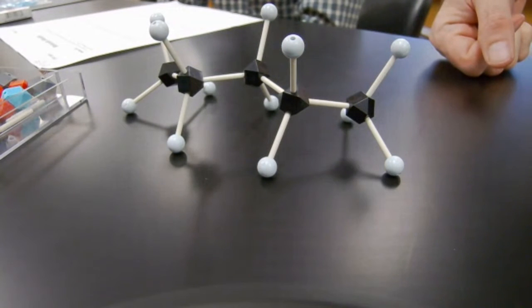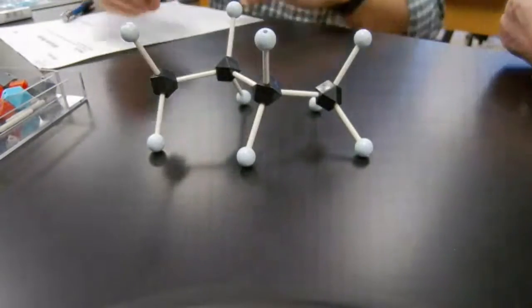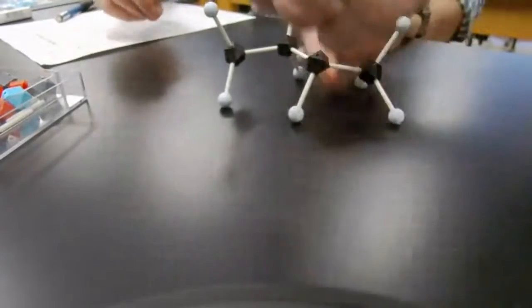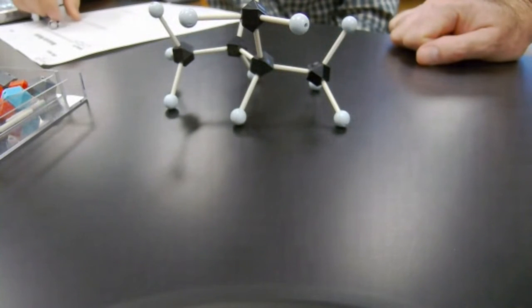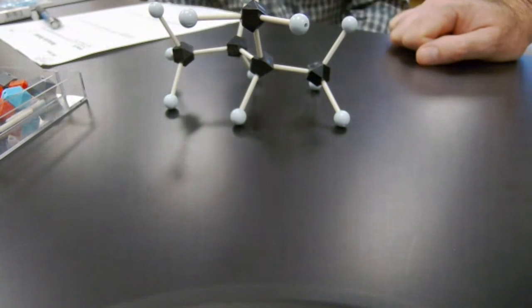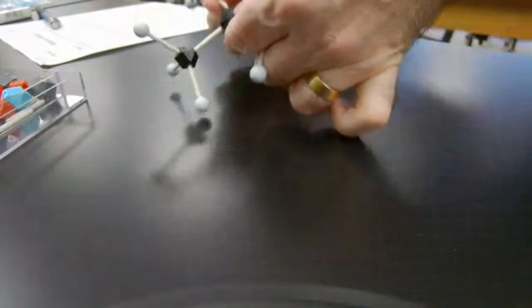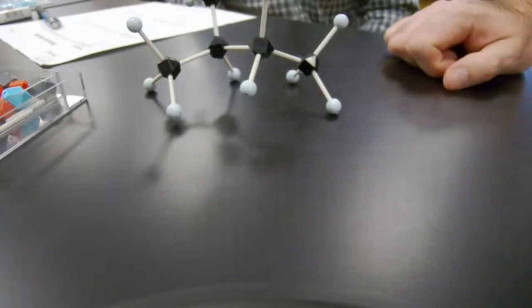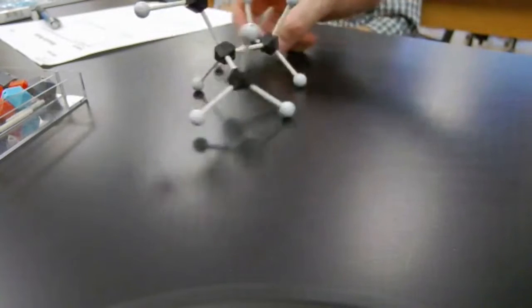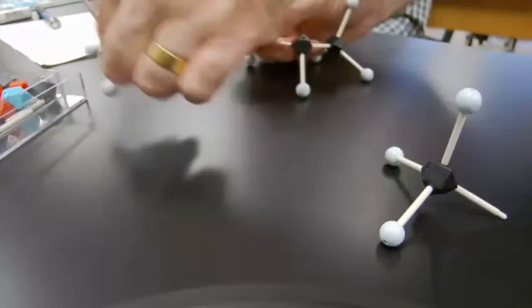That's where you start. The next obvious thing to do would be to take off a methyl and move it. And you make 2-methylbutane. And then move that methyl down the chain and make 3-methylbutane. Oh, wait. 3-methylbutane is 2-methylbutane. So you're done with the butanes, which means it's time to go down a carbon.